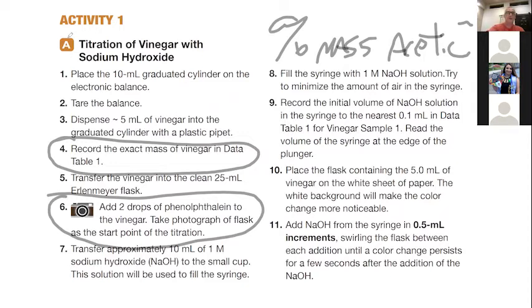And then we're going to transfer 10 mils sodium hydroxide to the small cup and then use that to fill our syringe. We don't want to have any air in the syringe. Be really careful with the sodium hydroxide. Like I said, that will not only burn your skin, it will dissolve it. So really make sure you got your goggles on. You might want to wear gloves as well.